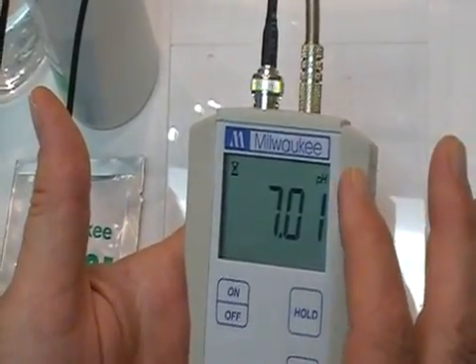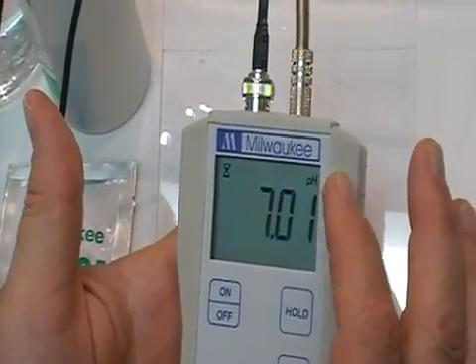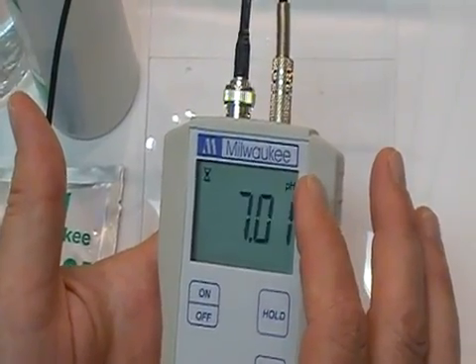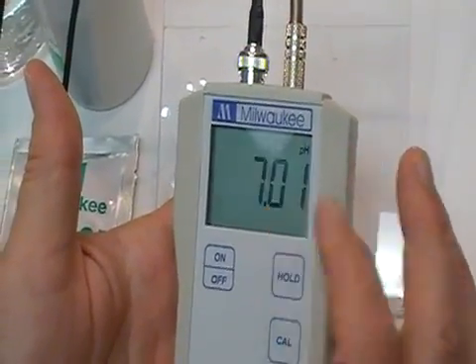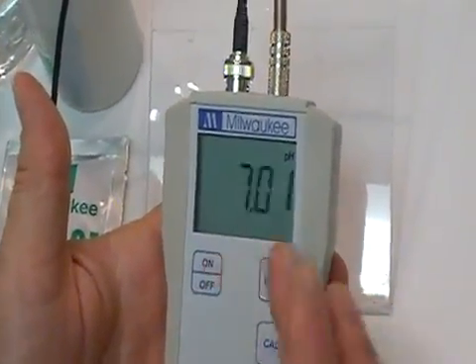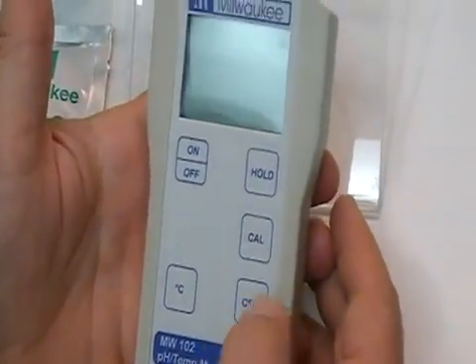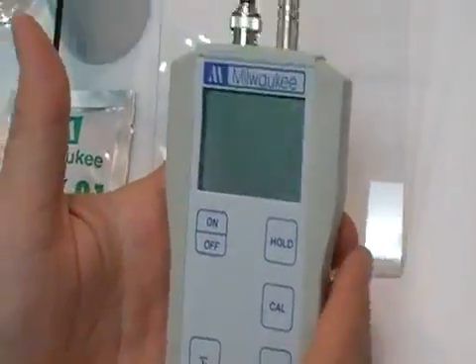In your instructions it says look for the pH tag to stop blinking. They are referring to the pH in the upper right-hand corner letters — pH — as you'll notice in just a minute. And there you go. The numbers will continue to blink, but the pH has stopped blinking. At this point you hit the CFM button.